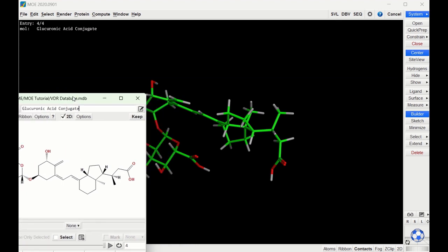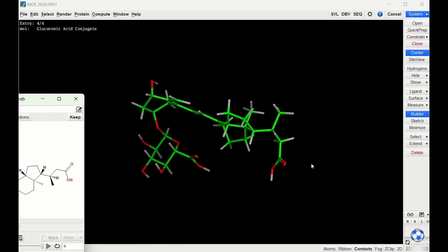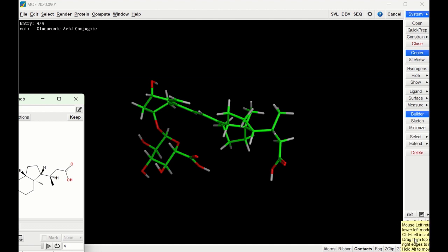One important thing to point out: if we look at this molecule, we have the carboxylic acid here and the glucuronic acid molecule here, so we have two carboxylic acids, and right now both of them are protonated with the OH functionality. However, if we're going to be docking these into the vitamin D receptor — which is a biological receptor under biological pH — the carboxylic acids would be deprotonated, and any amines would be protonated. So we need to deprotonate these carboxylic acids to make sure they can correctly dock into the receptor.